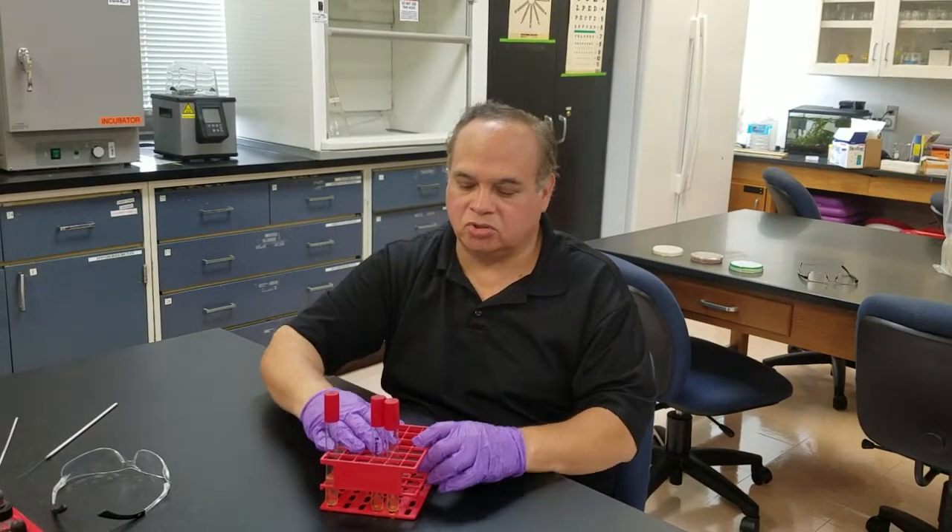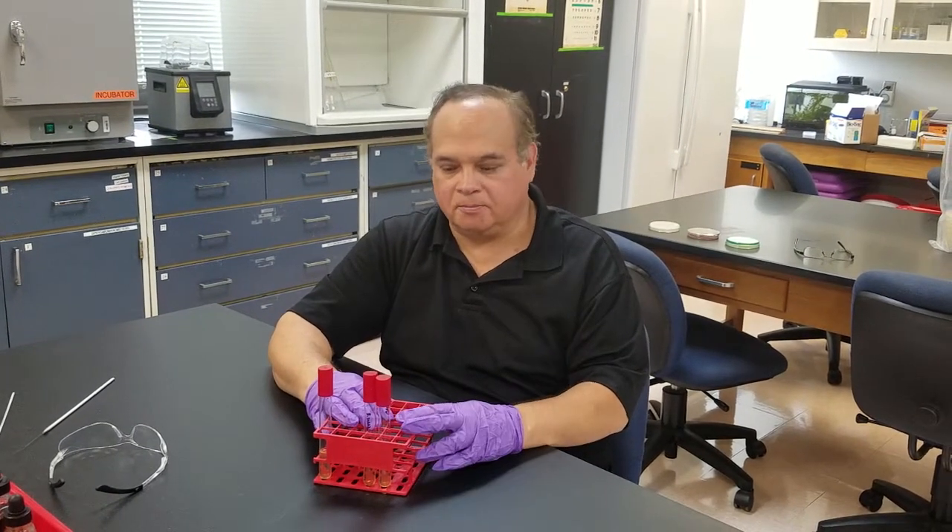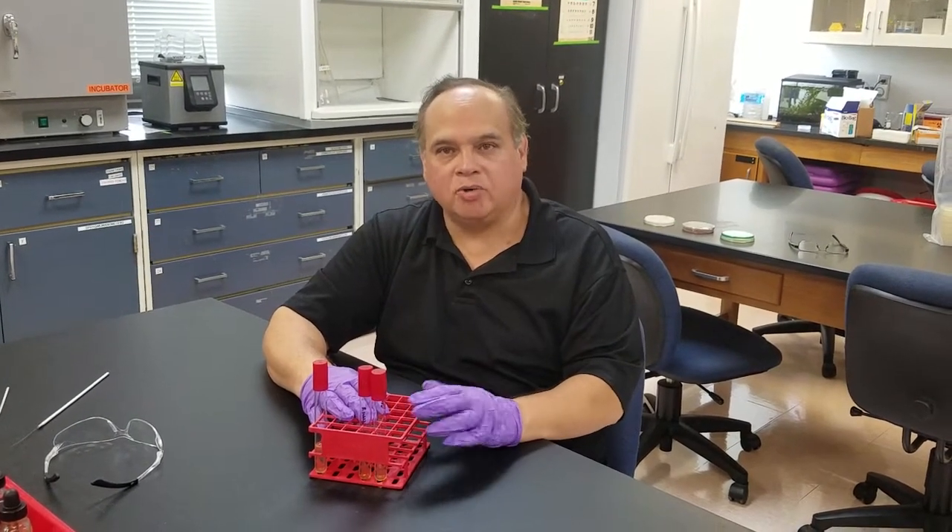This particular test is known as a gelatin hydrolysis test, and we're looking to see whether or not a microorganism, a bacterium, can break down or hydrolyze gelatin.